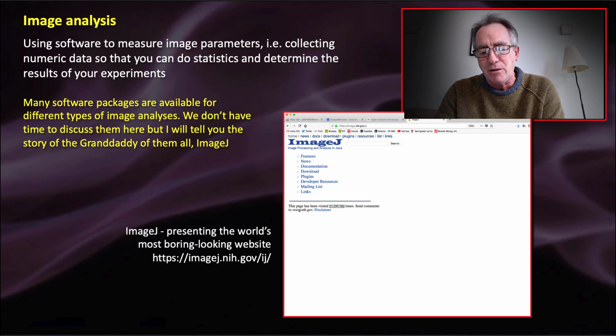So this is where image analysis comes in. Image analysis is basically opening a digital image file on a computer and making measurements. There are lots and lots of commercial image analysis software packages available. Some of them cost thousands or tens of thousands of pounds, depending on what they're made to do. The microscope systems that I've been talking about, both the confocal and the electron microscope systems that I will introduce in a bit, all come with their own software that's pretty capable.